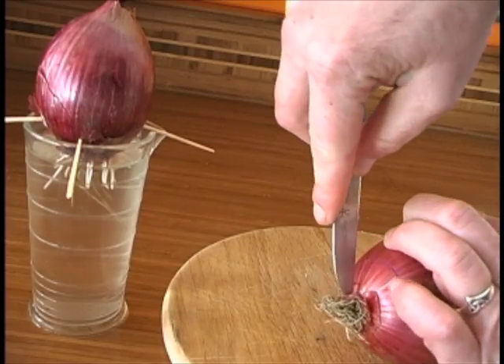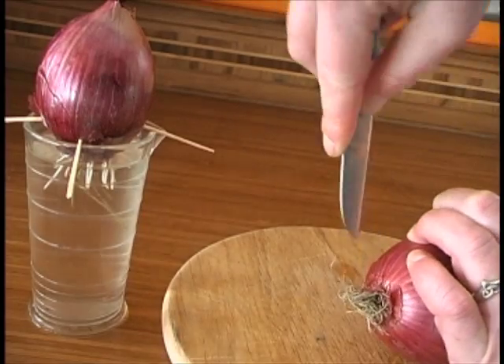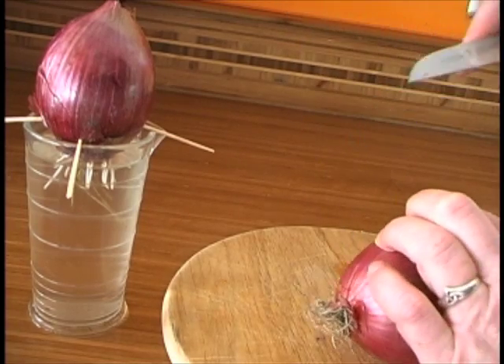You could also try making a cut vertically like this. You want to puncture the skin of the onion so that the water can penetrate and the roots can get out.